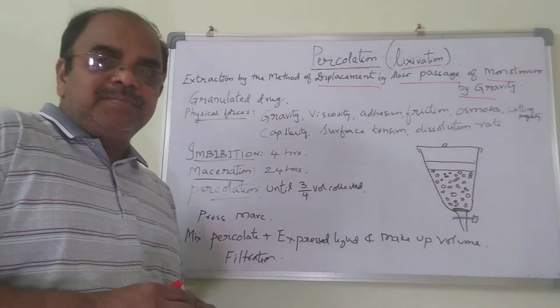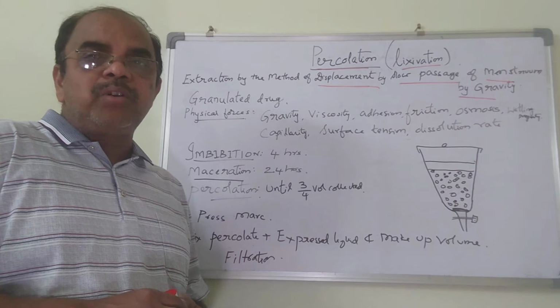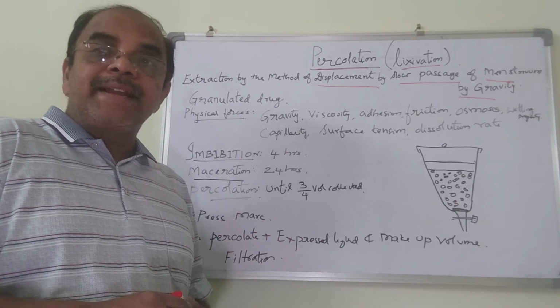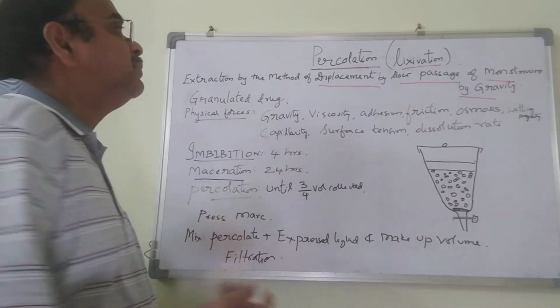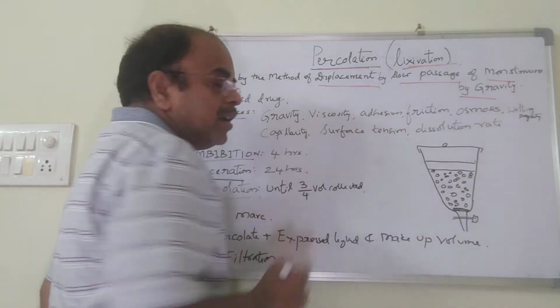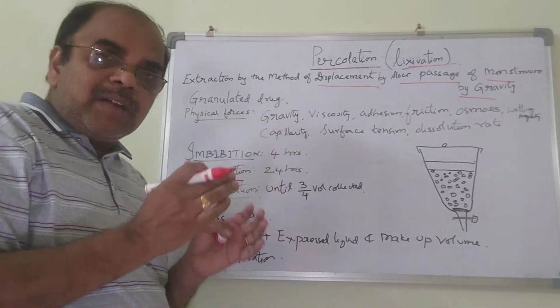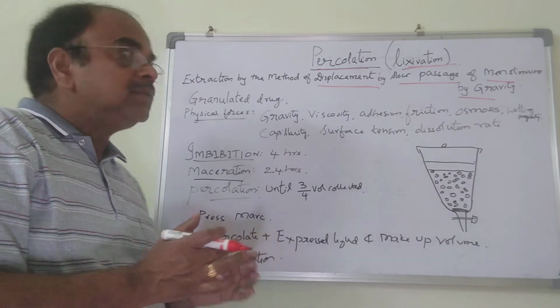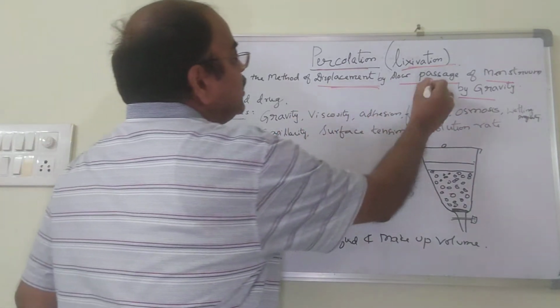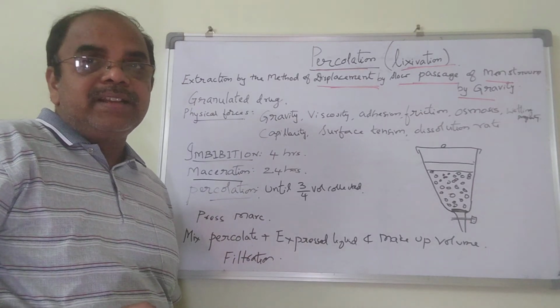In today's session, I am going to explain a method of extraction which is very important from the examination point of view: percolation. It is otherwise called lixiviation. Percolation is a method of extraction based on the principle of displacement, the slow passage of menstruum by gravity.